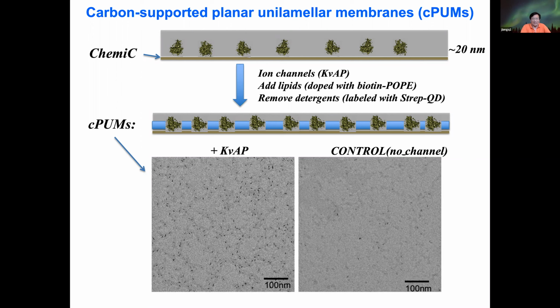As I mentioned, multiple labs around the world are advancing our technology in different directions, especially using graphene oxide. It's actually possible to further derivatize the graphene films and then do the same kind of presentation of bioactive ligands as we have shown.